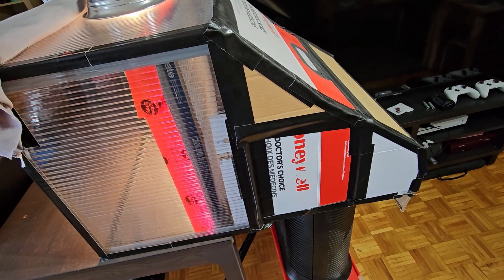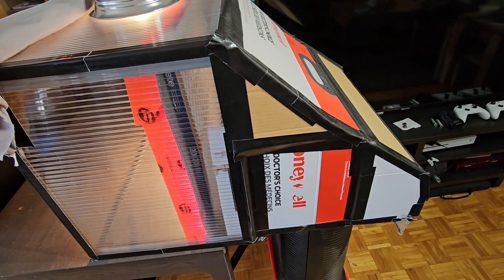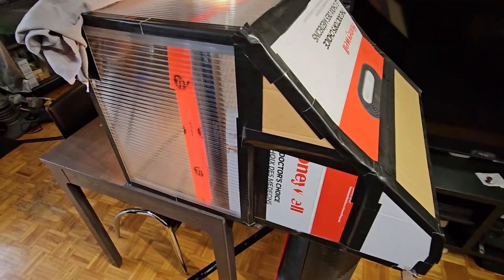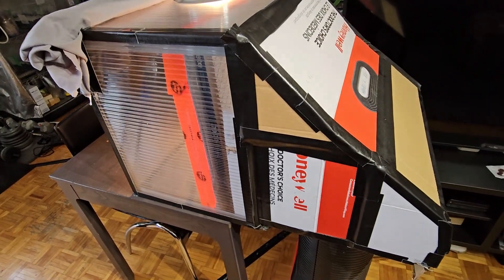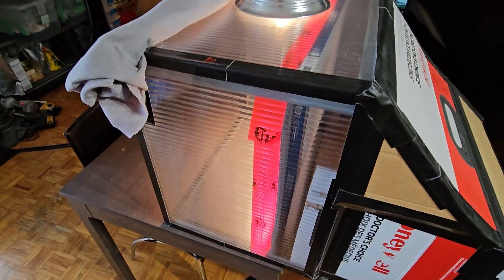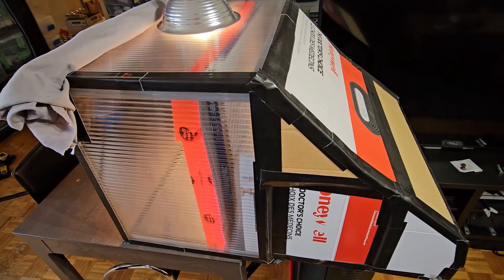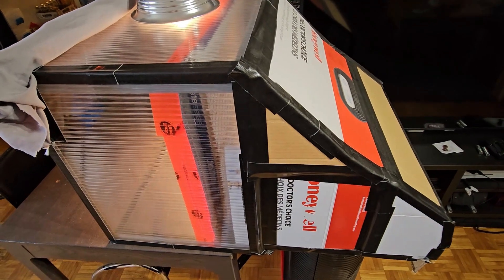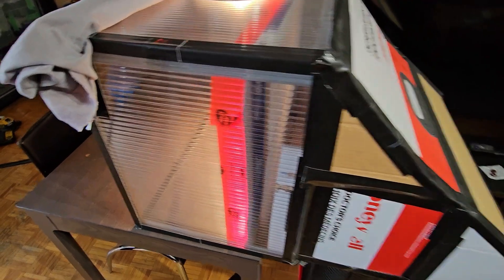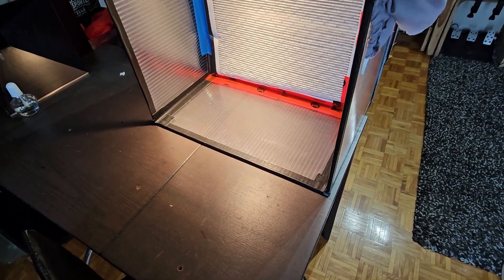All I've done is literally used the box that this unit came in, cut it up into a triangular shape to scoop the air. Then this is just a clear corrugated plastic sheet that I bought from Home Depot. I'll list out all the materials and costs, but like I said it's been about two years and I have about 99% success rate with all my cultures and transfers — it works absolutely perfect.